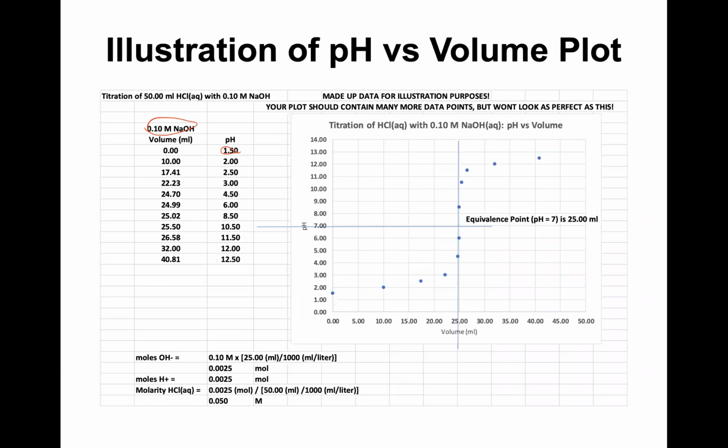According to that, this is the pH versus the volume, and you will be able to create this titration curve, right? So from here, you can easily find the end point, cross here, and find the volume. According to the volume, you will be able to find the molarity of hydrochloric acid. So something like this, you will be able to do. So in this lab, you can use both: one uses the indicator, another one uses the pH meter, right?